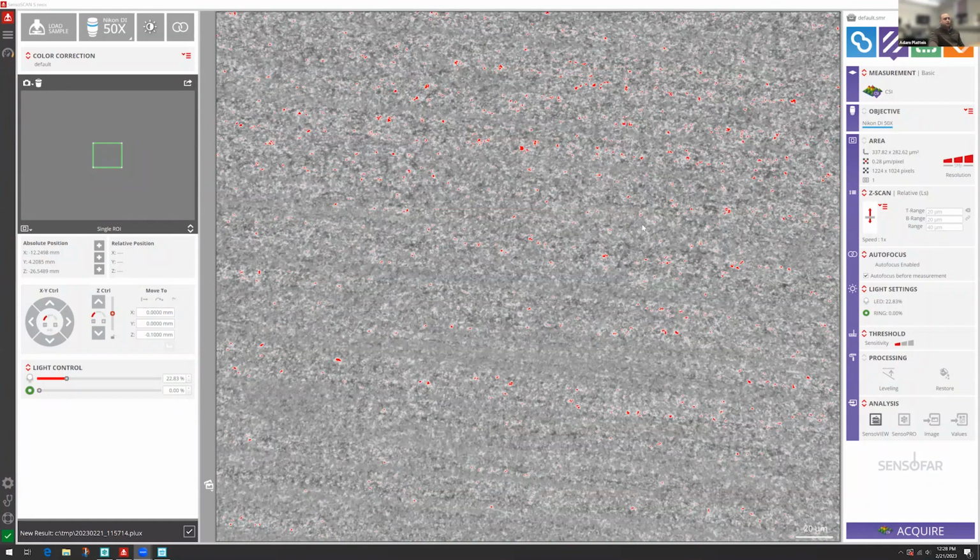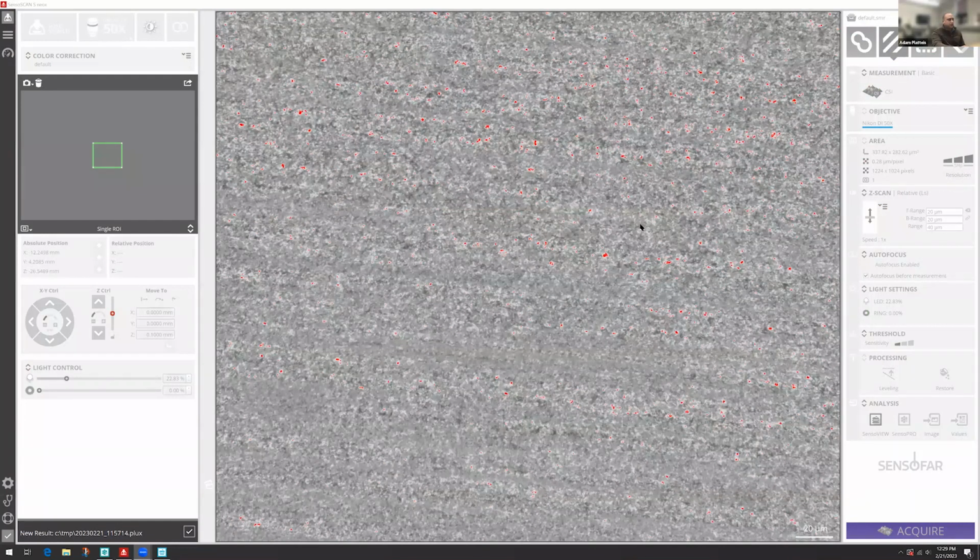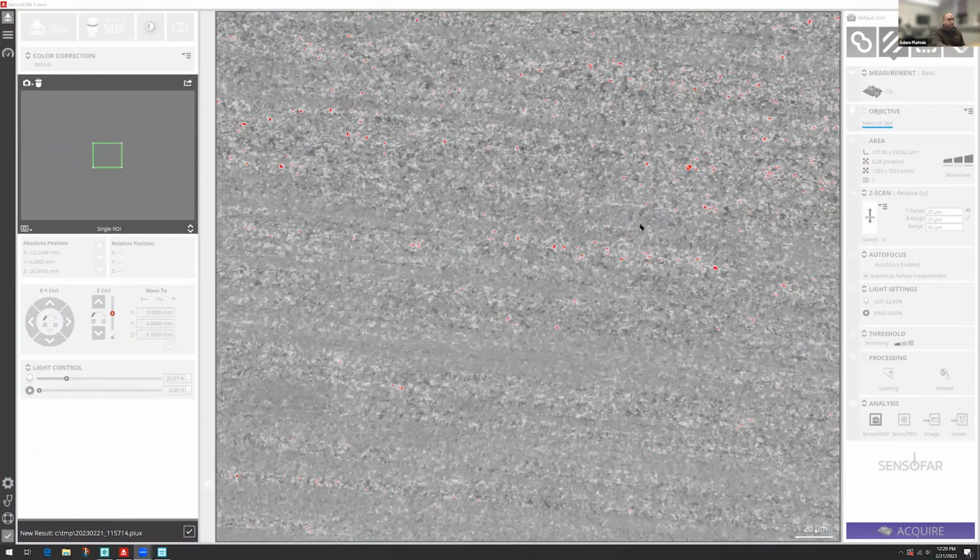Yep. All right. So as Daniel mentioned, we have some programs that allow us to automate analysis. And what I'm going to show you in this presentation is a roughness standard that's on our main SNEOX microscope. So we're looking in live time right now at a rough patch on a sample.